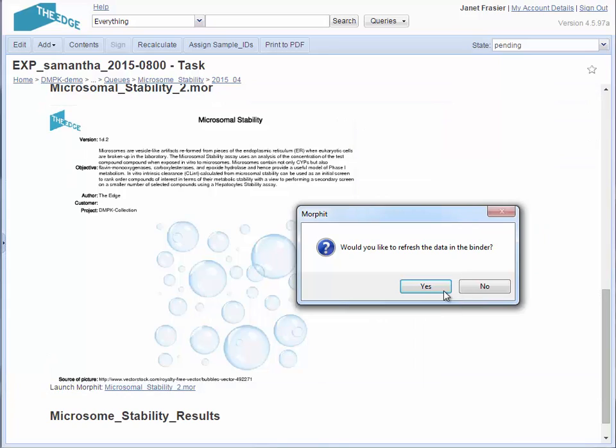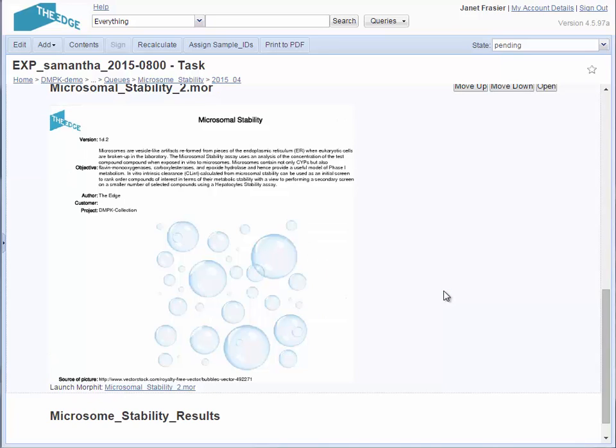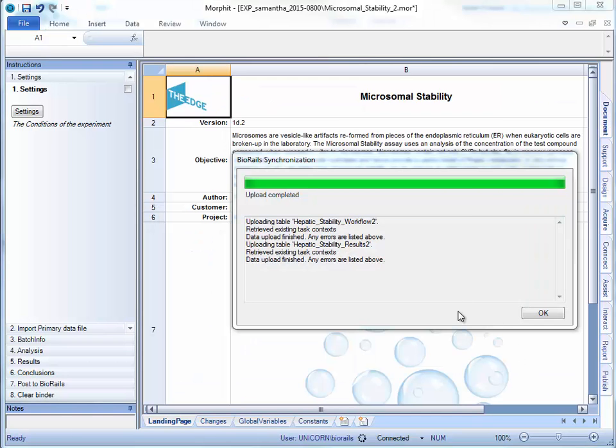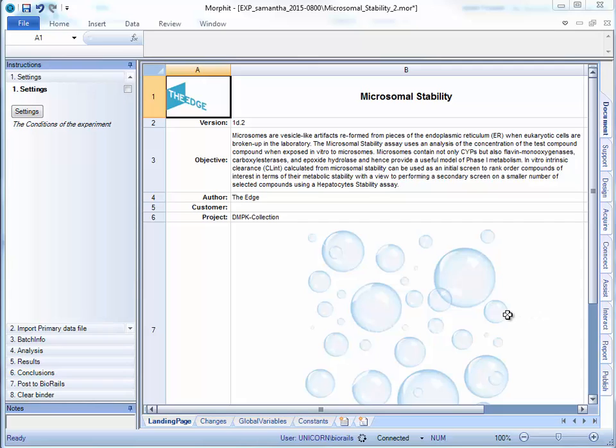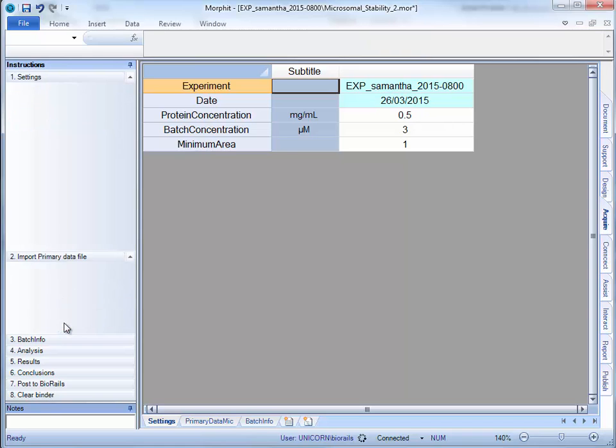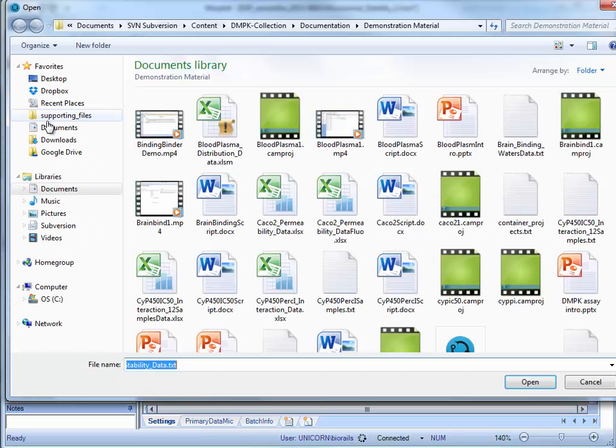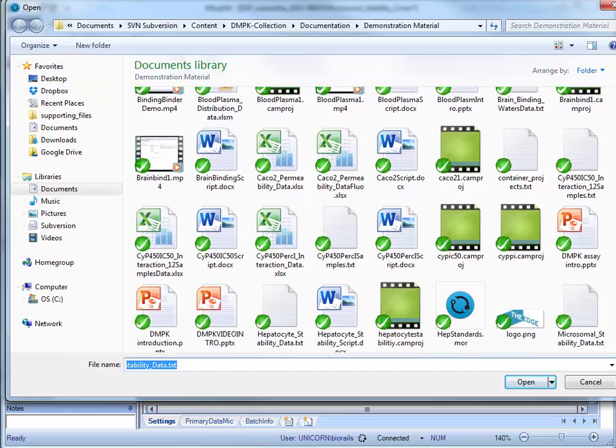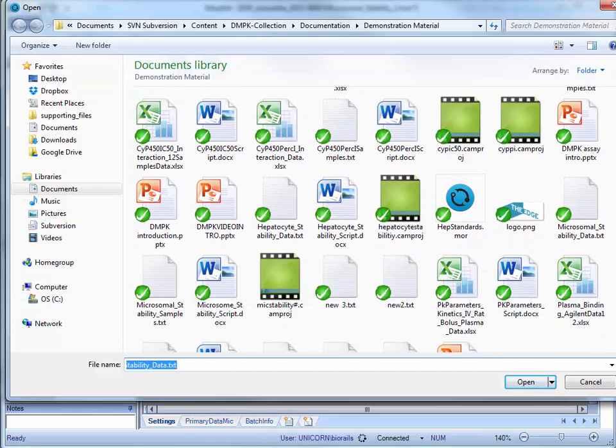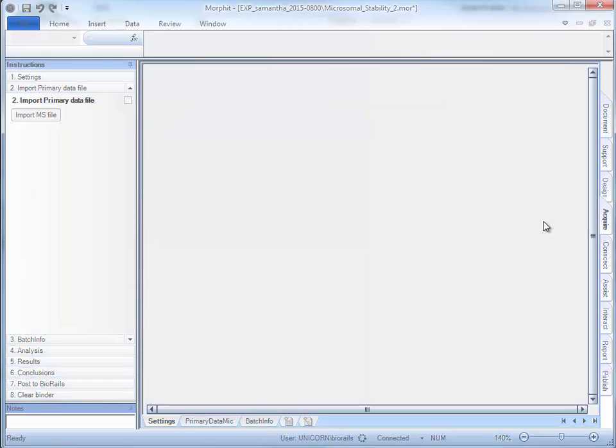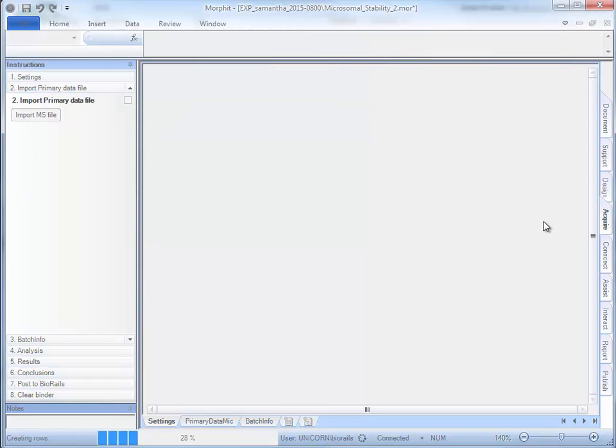The samples and settings are synchronized between the web service and the binder. I can first check the settings and then import raw data from an instrument file. In this case, a mass spectrometry file. The data is then organized and processed by Morfit.